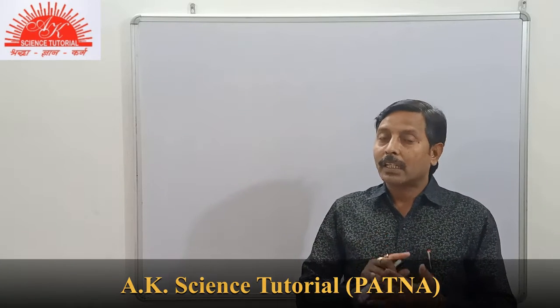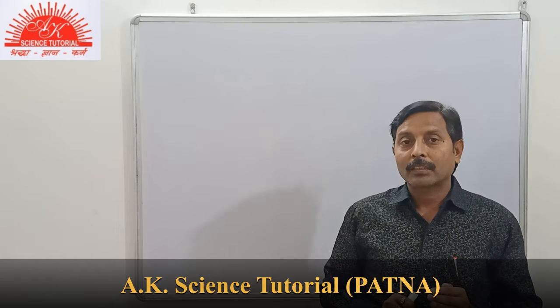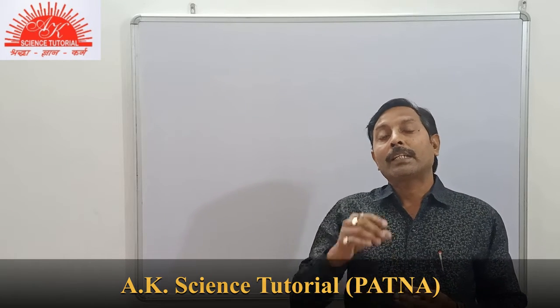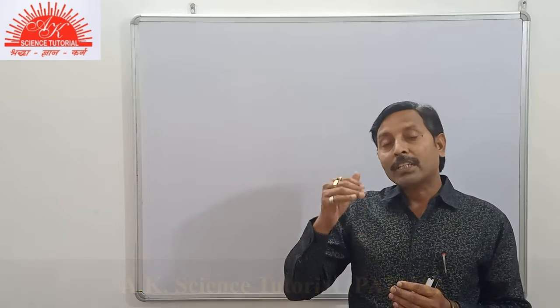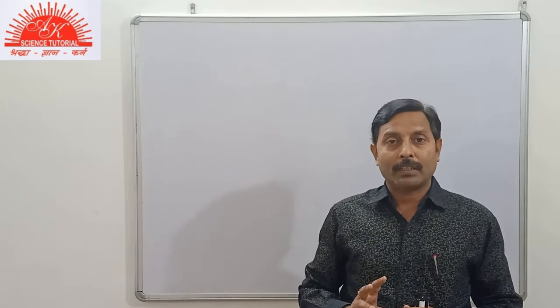We will study the test of gas, its related observations. Similarly, in the subsequent topics, we will study the test of anions, and the test of cations has been given in our analytical chemistry topic.